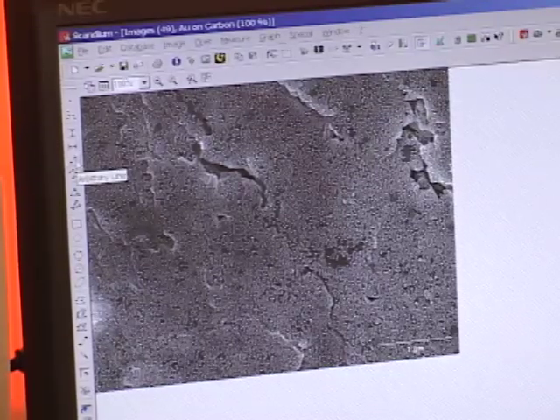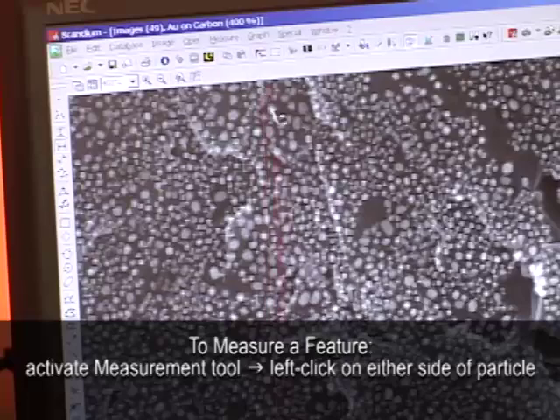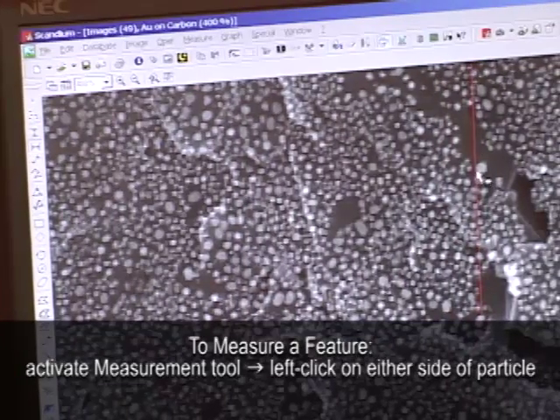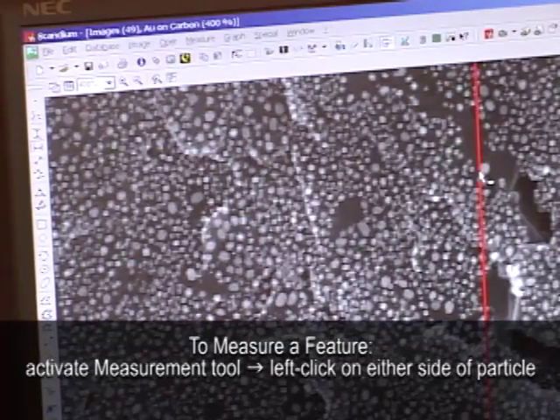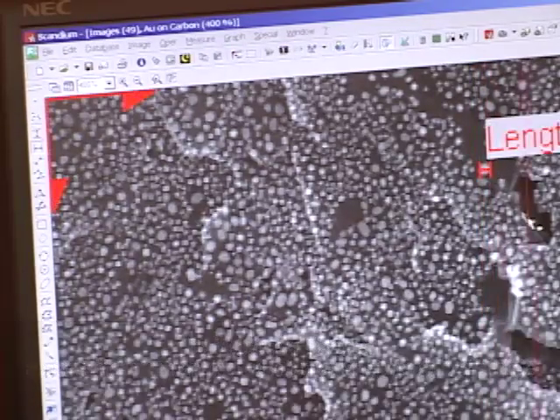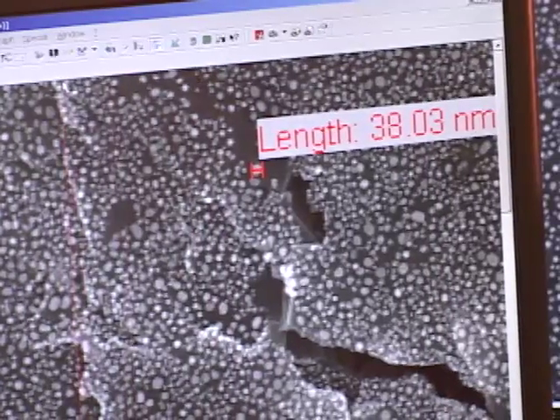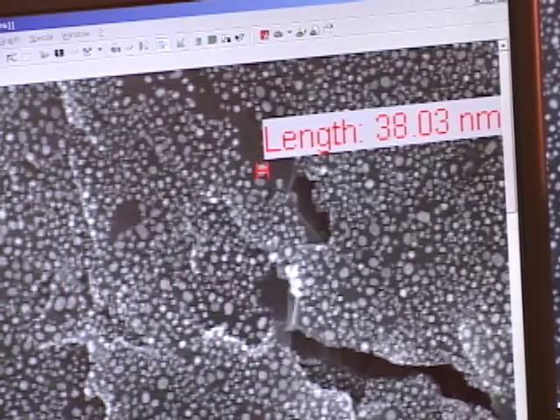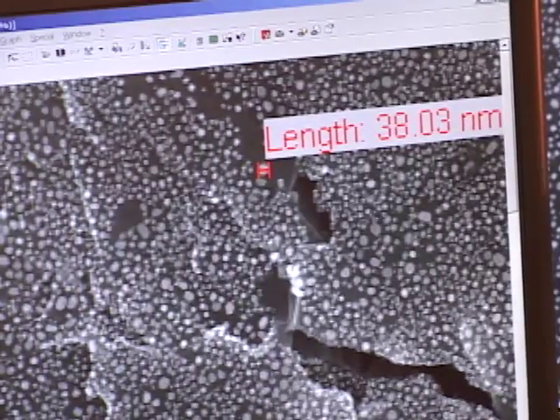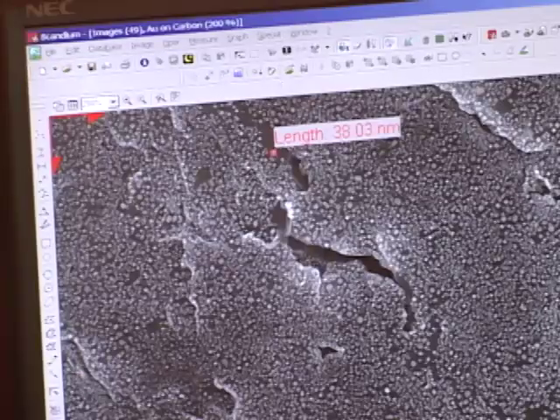I'm going to zoom in so that I can see better. You can see that my image is getting pixelated, so I won't go any further. I'm just going to take a horizontal measurement using Scandium — you left click the left side of the particle and then left click the right side. It gives me the length of that particle as thirty eight nanometers. When I'm done with the measurement, I push escape to drop the measurement tool, and then I'm going to zoom out.